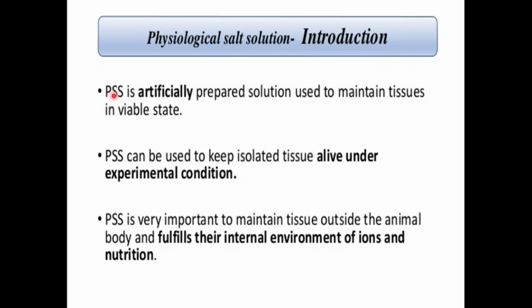So, physiological salt solution, or the PSS, is an artificially prepared solution. These are the solutions which you prepare in the lab. You simply take out the salts, weigh these salts, and dissolve them in distilled water, and you get the physiological salt solution. So these are artificially prepared solutions which are used to maintain the tissues in the viable or living state. And PSS can be used to keep the isolated tissue alive under the experimental condition.